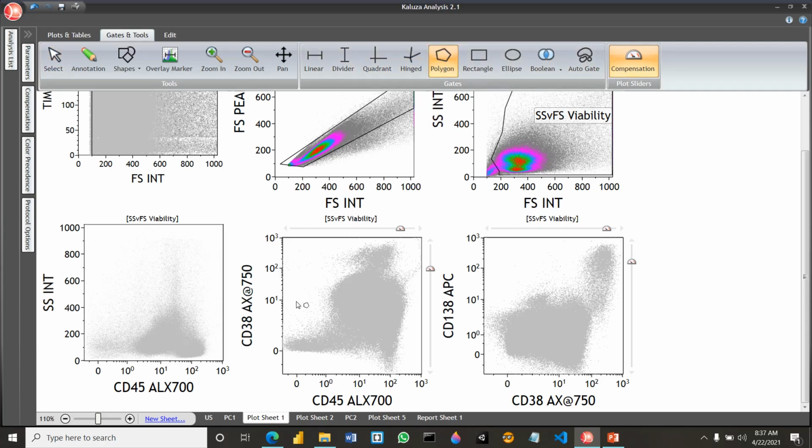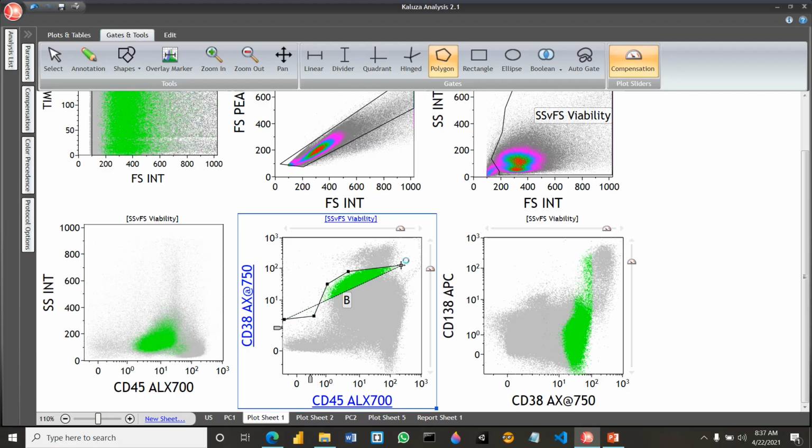And how do we do that is to first, as I mentioned, sometimes CD38 can be lost, so we'll start a little CD38, but in abnormal plasma cells, even CD45 is lost, so generally it is safer to take a little deeper on this side. So we always include the CD38 dimmer population in CD45 negative, because if you have CD45 negative, CD38 dim, there are very high chances those cells are basically plasma cells.